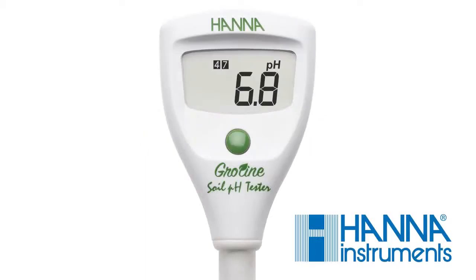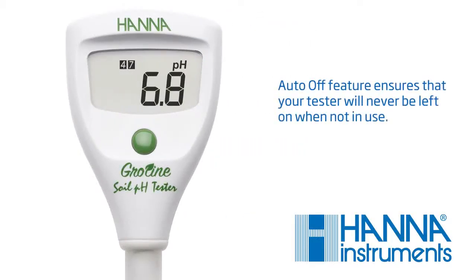Your tester comes with a selectable auto-off feature, preserving battery life and giving you peace of mind in case the tester is accidentally left on.